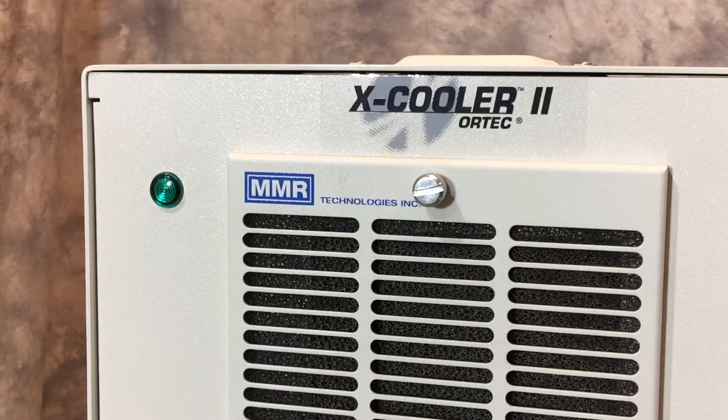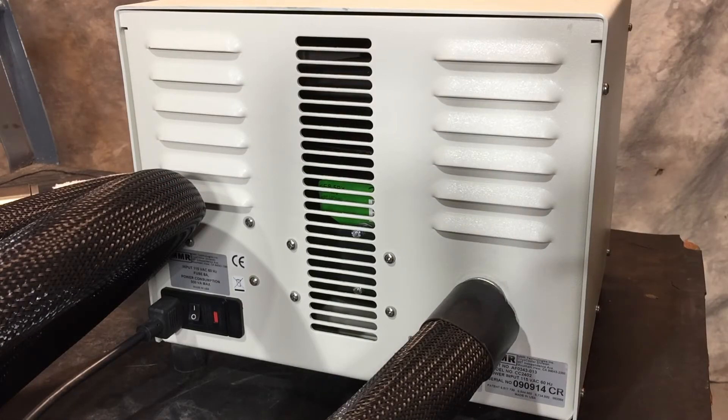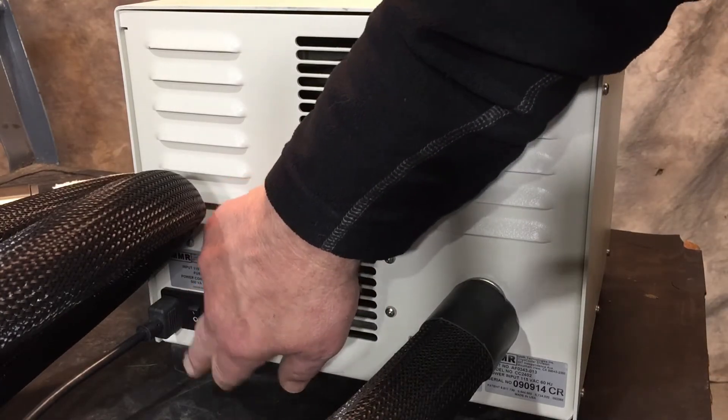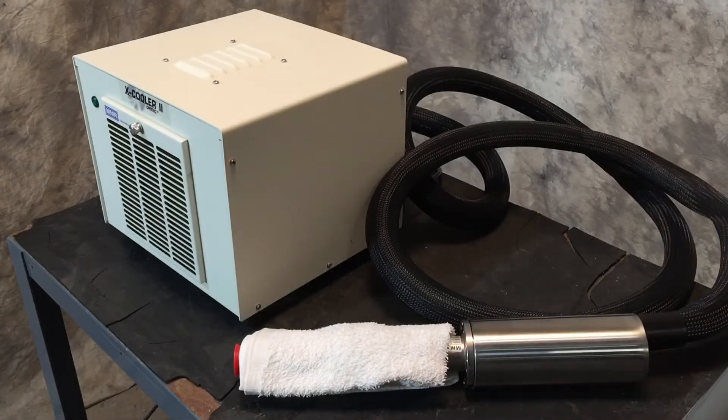At this point, if the compressor is shut off, it must be allowed to come back to room temperature to allow that refrigerant to recombine. After everything looks in order, we power the unit down and let it sit undisturbed for at least a couple of hours.